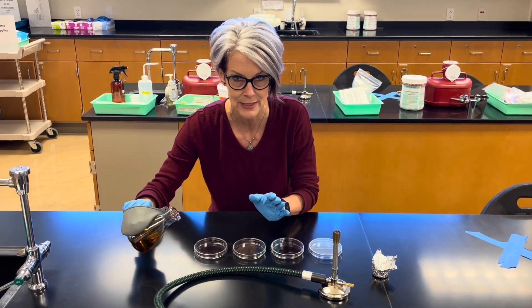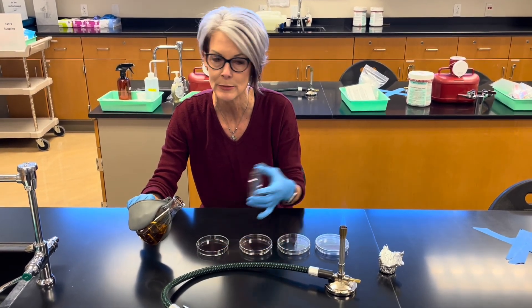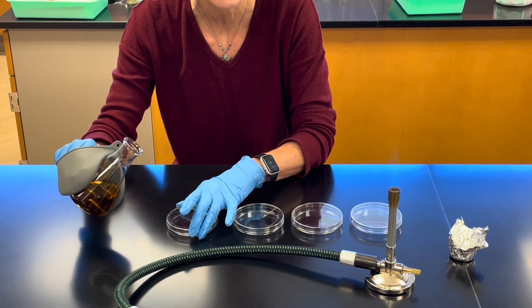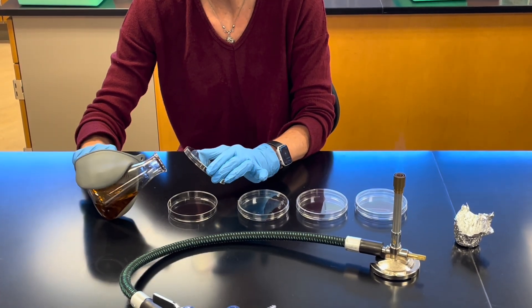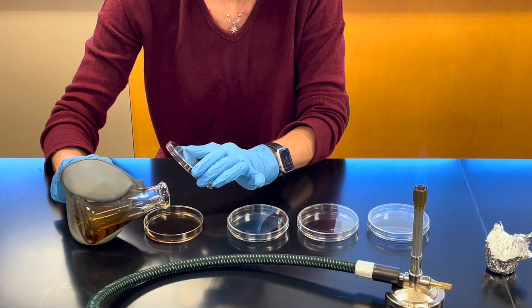As mentioned, you want to do this aseptically. We're going to pour about 20 mils into the petri dish. You want to lift the lid, but don't put it down on the bench and don't wave it around. We want to do this aseptically with minimum chance of contamination. Just lift it a little bit and pour about 20 mils of fluid to fill up the bottom part of the dish about halfway.